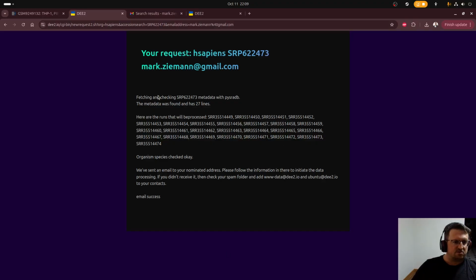And what we've got is some information about the request. PySRADB has checked that this SRA project number matches the organism that we specified. It gives us a list of the runs. Everything was checked okay, and an email was sent, as you could hear from the notifications going off.